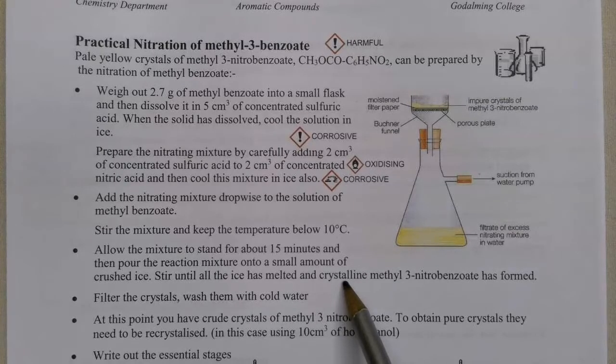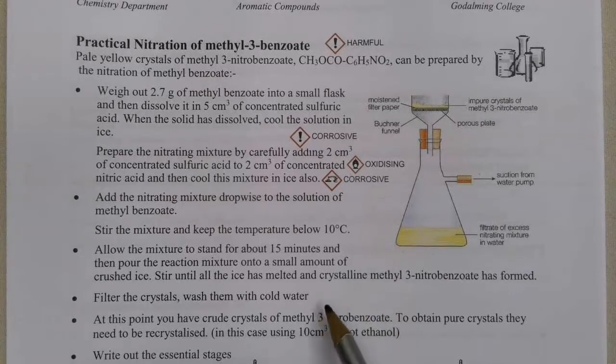Now what that will do is it will destroy the catalyst. So it'll dilute the sulfuric acid enough so that it'll no longer work as a catalyst. You can then filter your crystals using a Buchner flask and funnel, which looks like one of these, and wash them with cold water to remove any acid impurities. At this point, you're going to have crude crystals of methyl 3-nitrobenzoate. To obtain pure crystals, you need to recrystallize them.